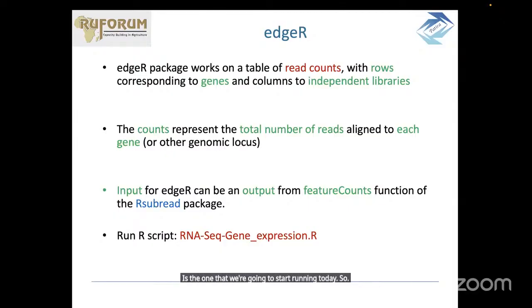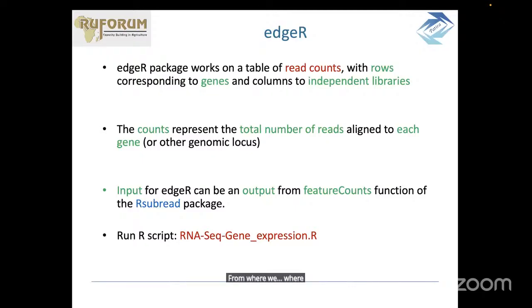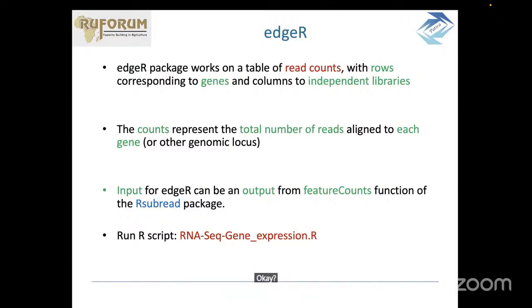So we're going to do gene expression together. But before we do gene expression, we need to start from where we stopped yesterday, because we are doing an RNA-seq workflow. Okay, I'm going to share with you how we should do it. This time we'll go to RStudio, open RStudio, and from RStudio we're going to be in the RNA-seq directory.